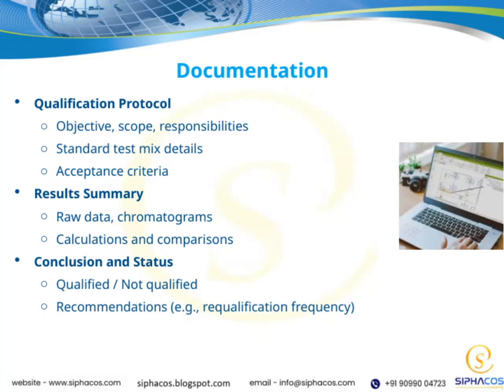Let's take a closer look at the documentation section of our qualification protocol. Here, we outline the objective, scope, and responsibilities to ensure everyone understands their roles and what the validation aims to achieve. We also include the standard test mix details, which specify the parameters and tests performed during qualification.